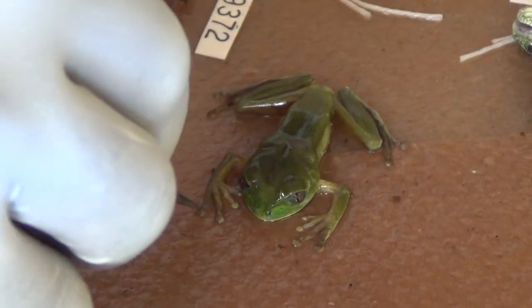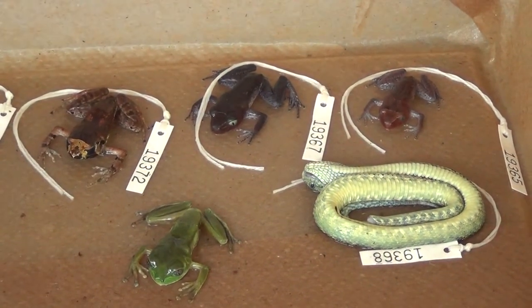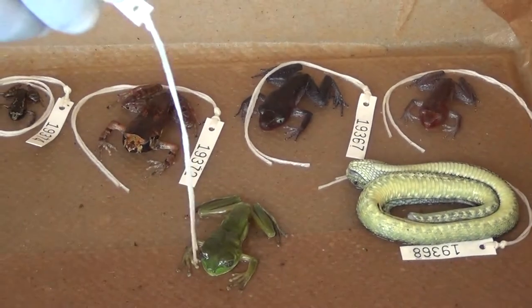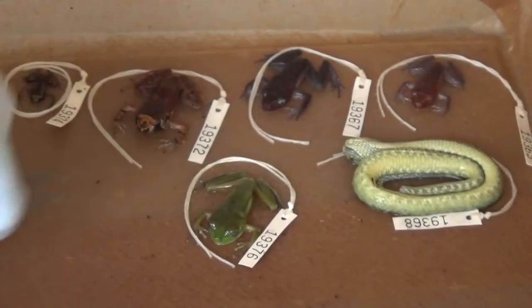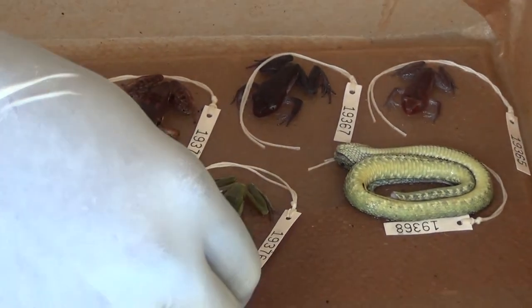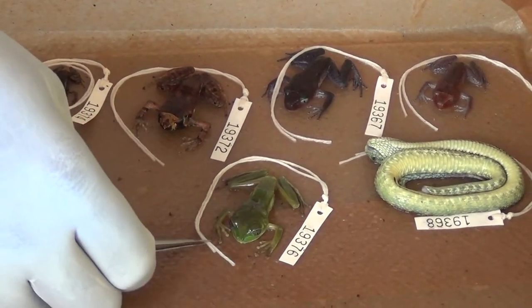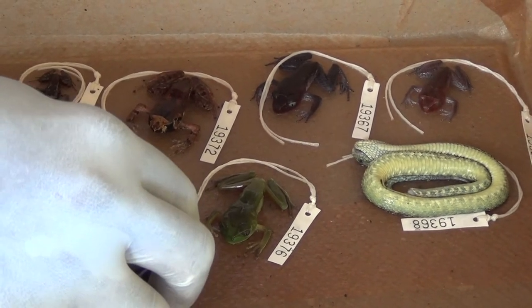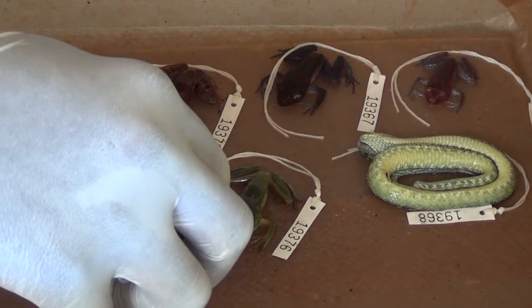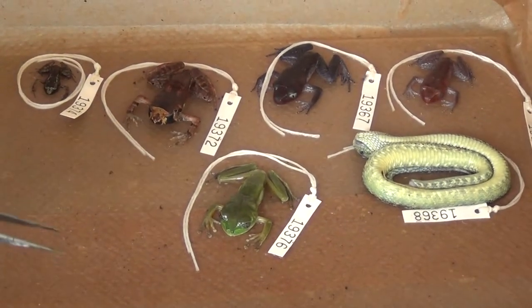For the other specimens you'll see that the tag is placed next to the specimen rather than tied on immediately, because tying the tag on beforehand can make it difficult to pose the frog or lizard correctly. So after it's in the right position, we associate it with the tag, it stays like that overnight, and in the morning when it's preserved, we tie the tag onto the fixed specimen and then pack them for transportation.